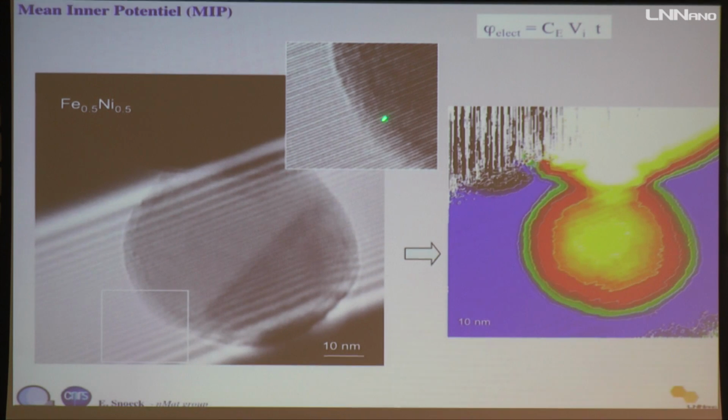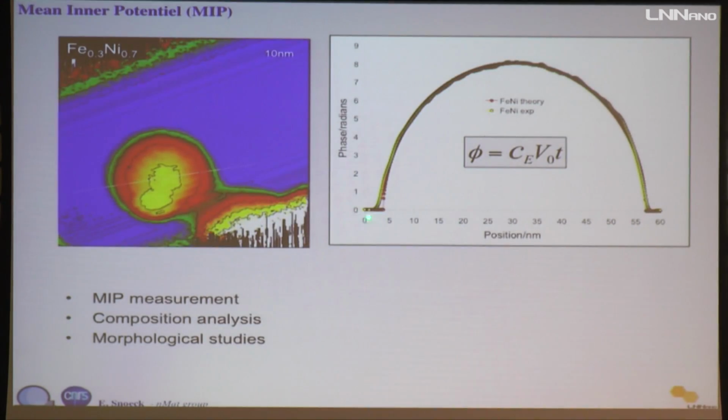And you see, if you zoom on this part, that you have the bending of these fringes. Bending means you are looking at the phase shift of this center fringe in the vacuum and when entering the material. And this is the phase you extract from that. So this is the image of that, and with that, you can directly see that you have a perfect sphere profile.